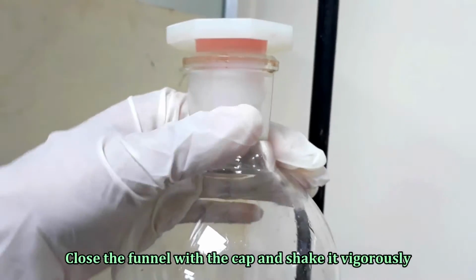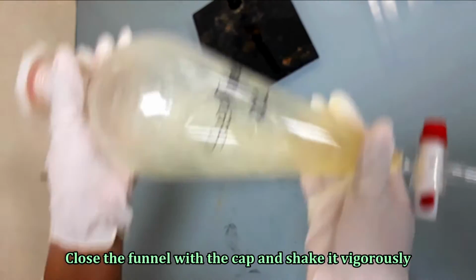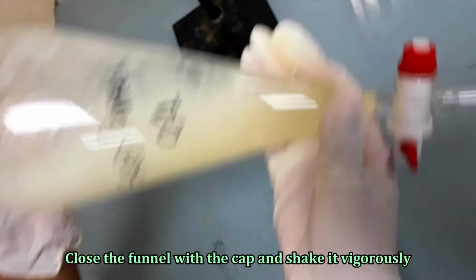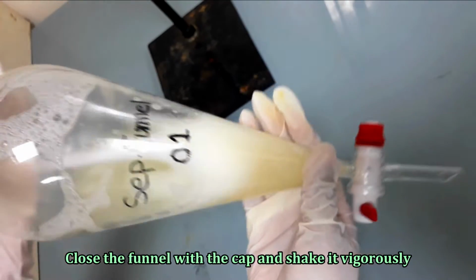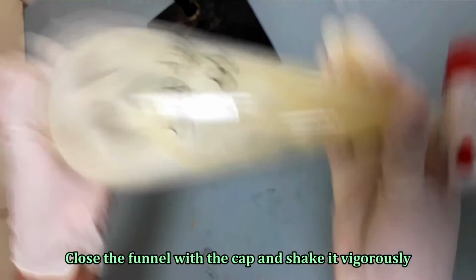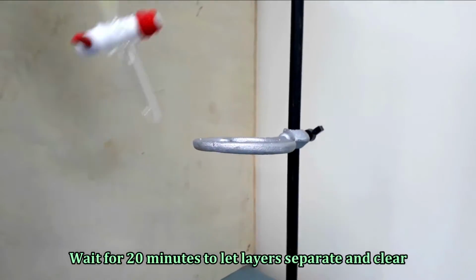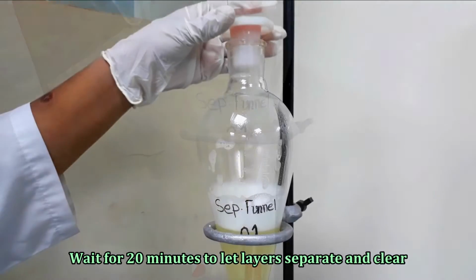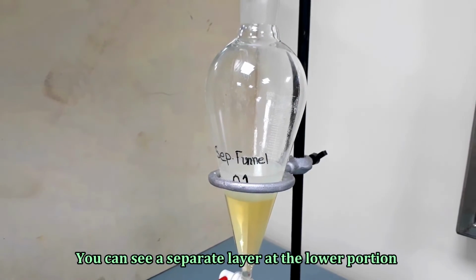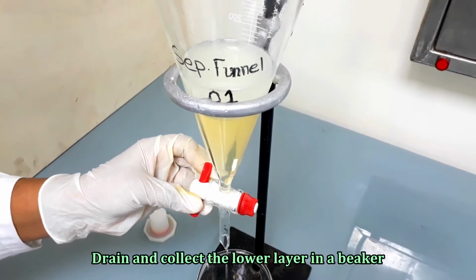Now close the funnel with the cap and shake it vigorously. Wait for 20 minutes to let layers separate and clear. Drain and collect the lower layer, which contains water and other mixtures.